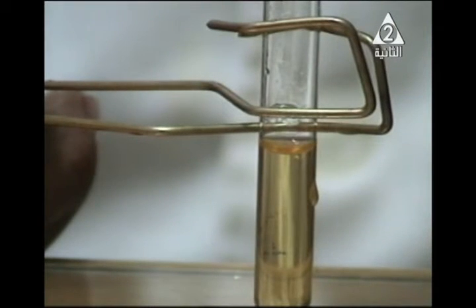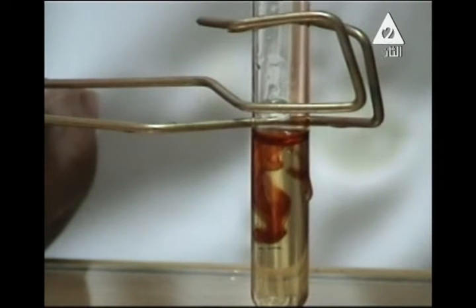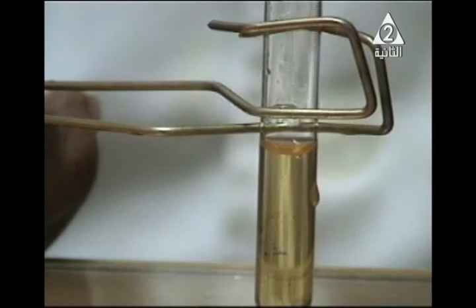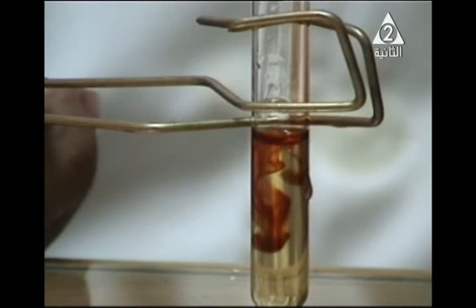As shown, my dear student, on the screen, on adding sodium hydroxide to iron 3 salt solution, such as iron 3 chloride solution, a reddish brown precipitate of iron 3 hydroxide is formed.